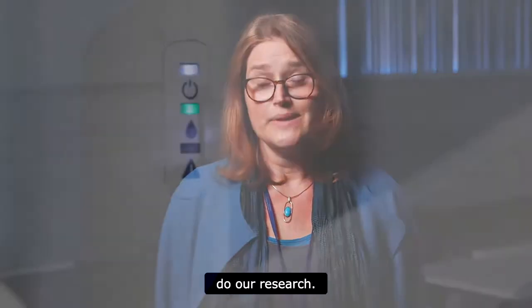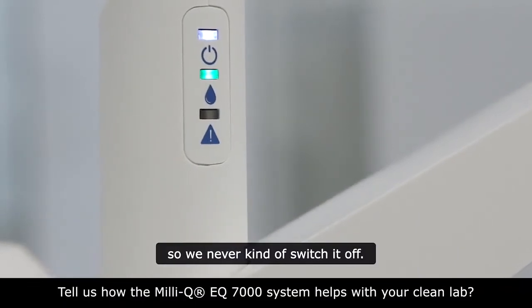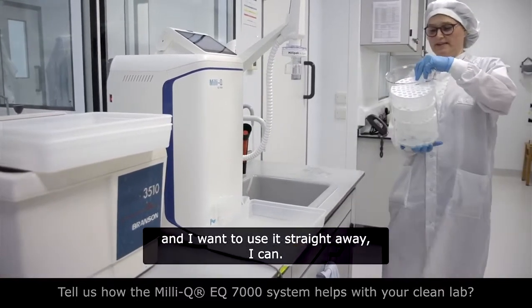Basically, if we haven't got clean water then we can't do our research. The system is running all the time, so we never switch it off. When I come in and I want to use it straight away, I can.